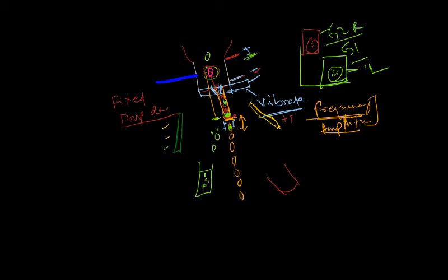Then the opposite charge is applied. On the right we have the positive charge plate, so when it applies the negative charge, as the cell is breaking off, at that point of time it carries the negative charge, and the droplets surrounding it carrying negative charge would deflect towards the right where there is a positive voltage plate. So this is how it is.